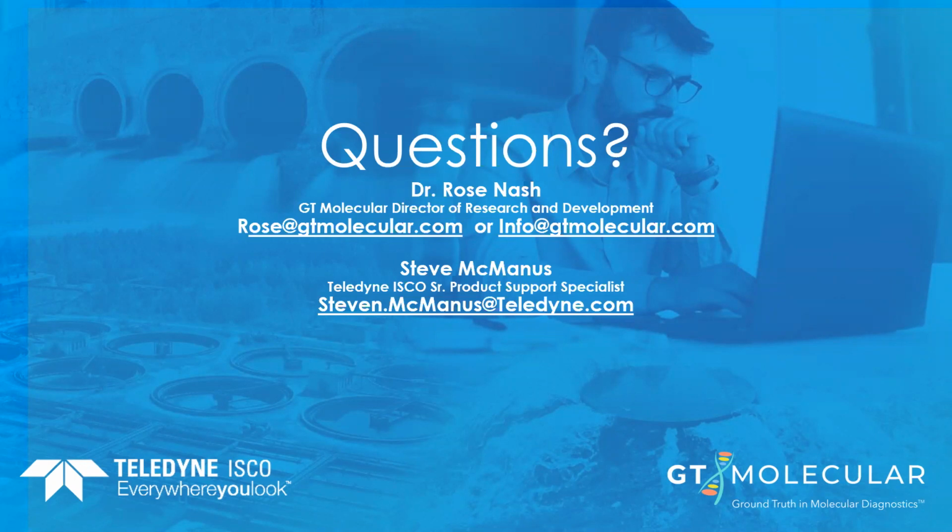Thank you, Dr. Nash. There's another question here that relates to samples collected using the manual grab approach that are getting rejected by the lab due to high solid content. How can autosamplers help in this area?